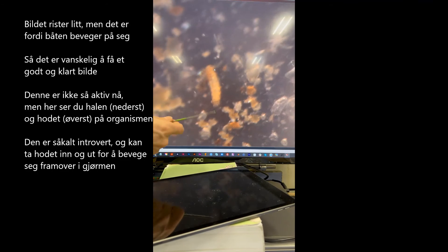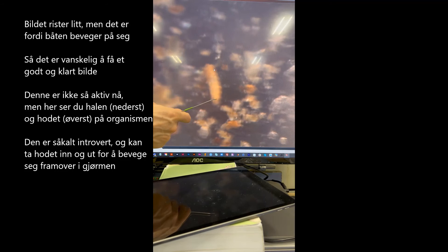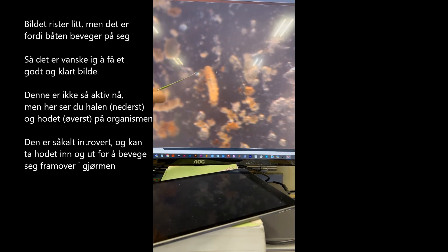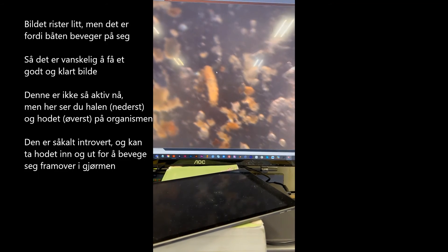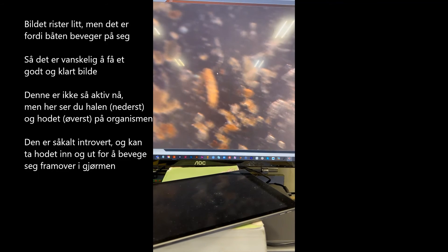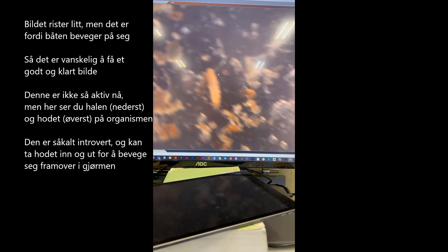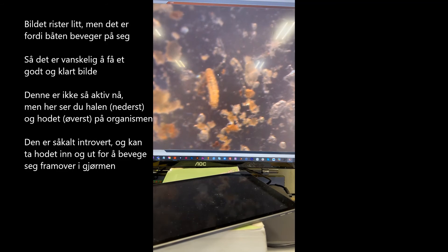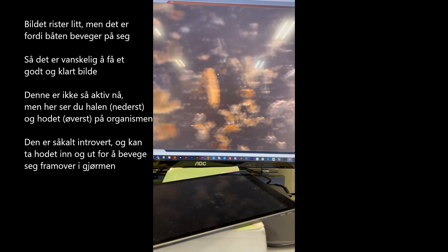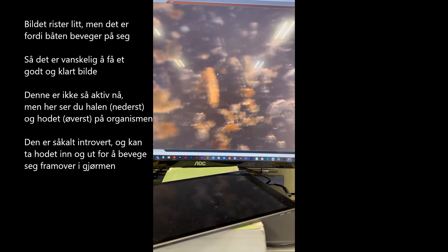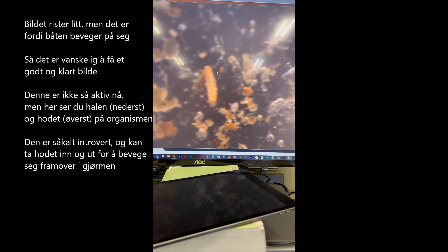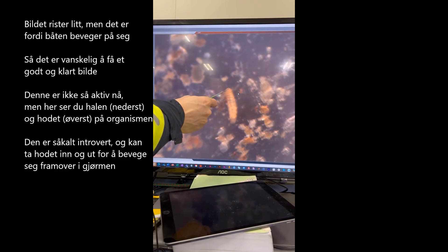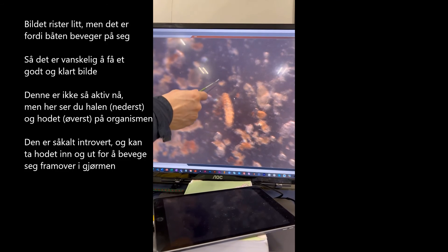This one is not very active right now, but you can see the back here and the head here. They have something called an introvert, which means they put the head in and out — and by this they move through the sediment. It's a trunk: a body, then a neck, and then the head comes out.